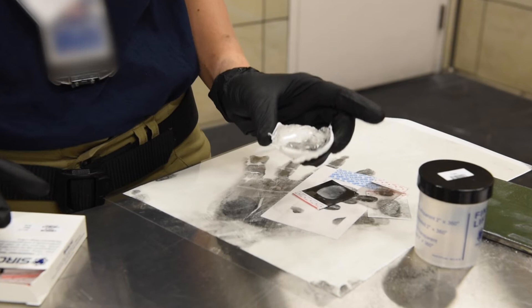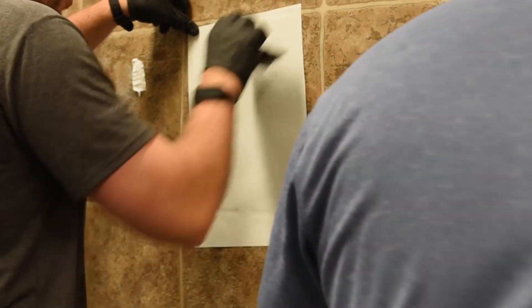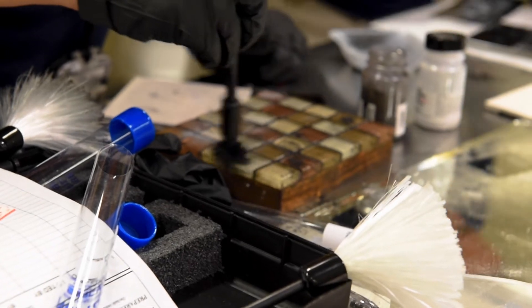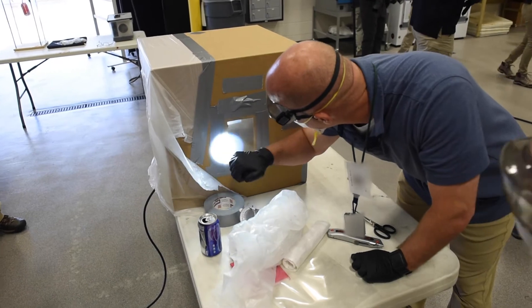We find that the students learn best by doing. You can tell them the theory, you can show them on a PowerPoint, but until you actually go out there and do it, a lot of it is technique — how you hold the brush, how much powder you put on there, how you use the super glue chambers behind us to properly preserve the prints.